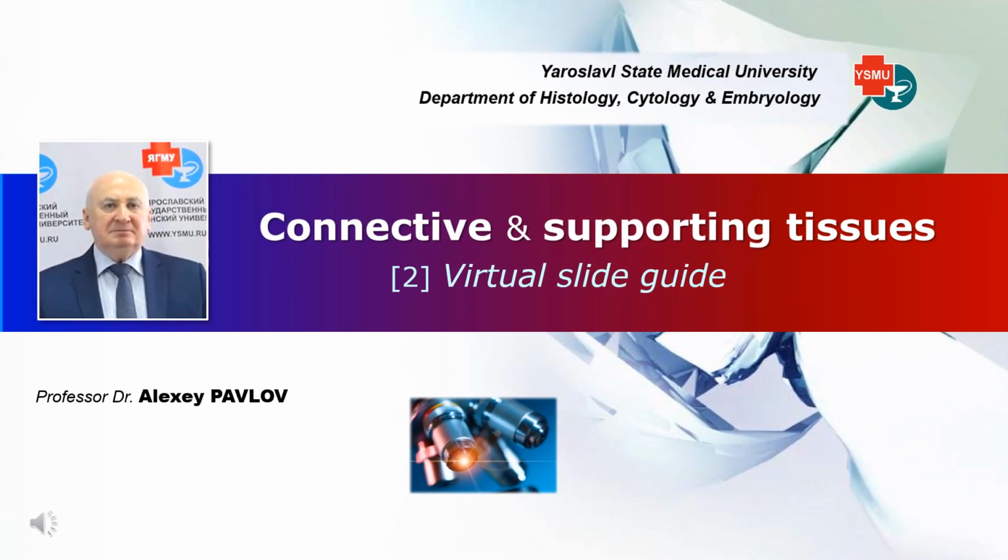Dear audience, the primary object for microscopic study of the structure of organs and tissues is a high-quality histological specimen. Along with studying theoretical material, the ability of a student to correctly diagnose microscopic structures is an essential condition for successfully mastering the histology course at a medical university.